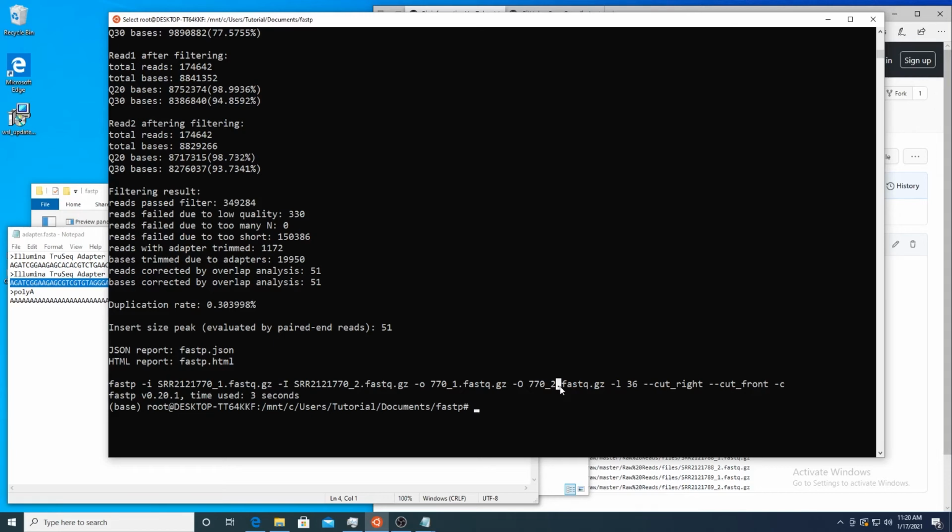Well, for NextSeq and NovaSeq systems, this no color is actually a G base pair. So if there's no base that's being read, it's still going to be recognized as a G, which may or may not be there. And so it could be a good idea to just remove any of those at the end of a read and repeating Gs. So no signal at the end of a read.